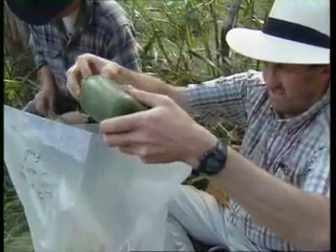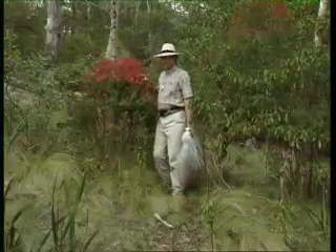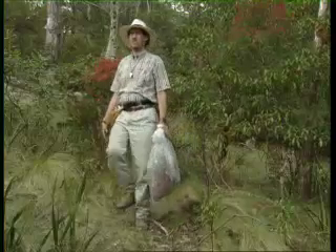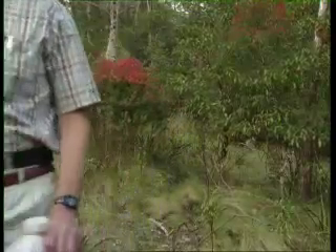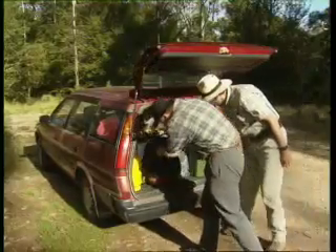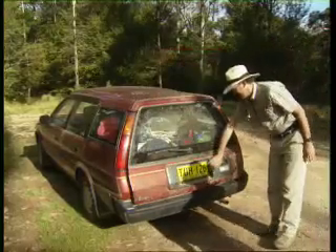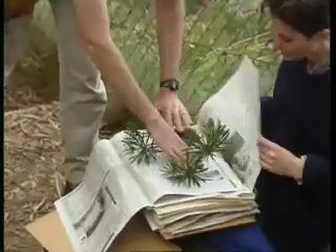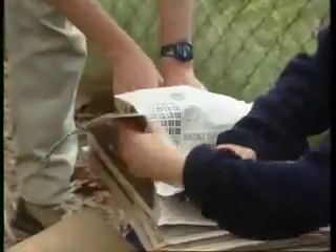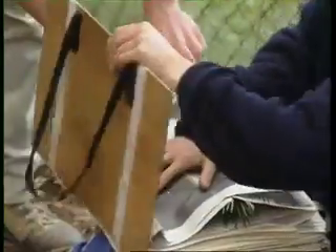Specimens are either tagged now or a single tag identifies the site. A rubber band seals the bag. At the end of the day, the specimens can then be tagged if you haven't already done so, and transferred to a press. This method is quick, but fragile flowers will shrivel and mix-ups with specimen numbers are more likely. A new plastic bag for each new locality should minimise mix-ups. An alternative method is collecting and tagging individual specimens and placing them immediately into a day press.